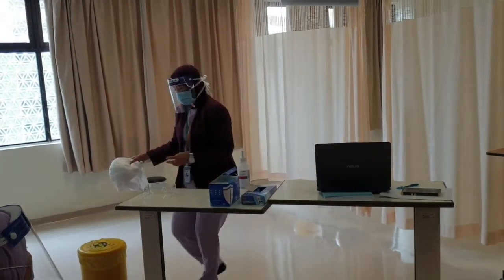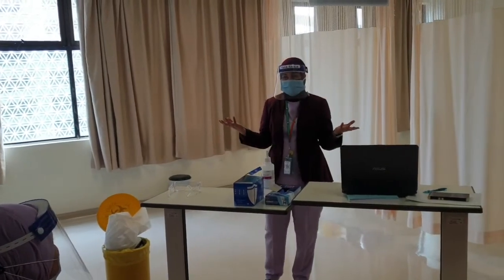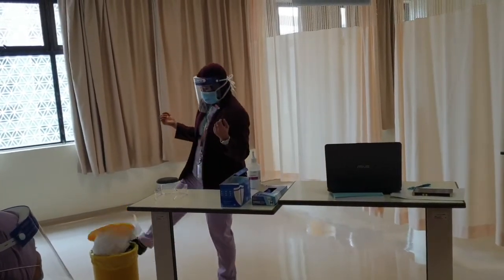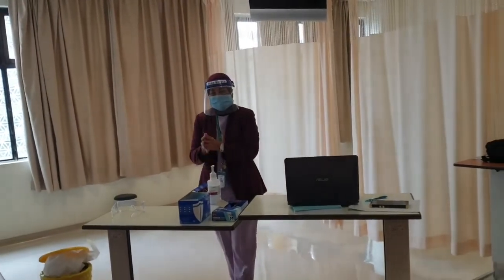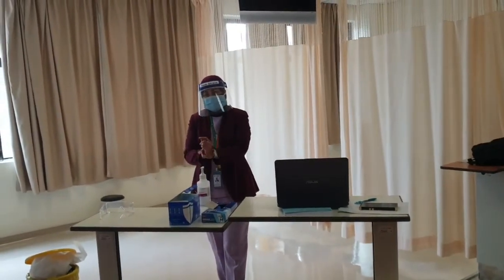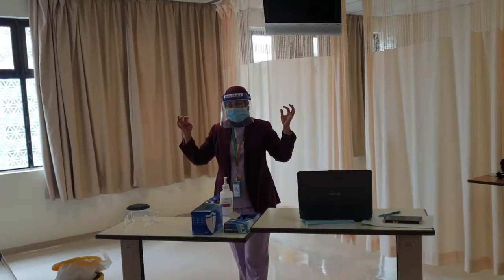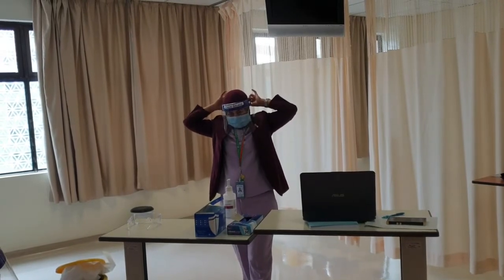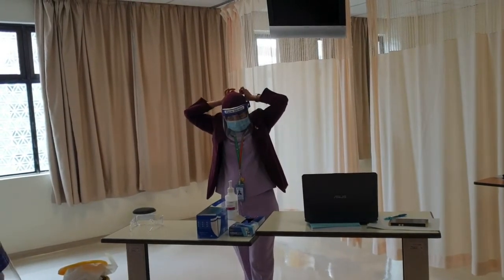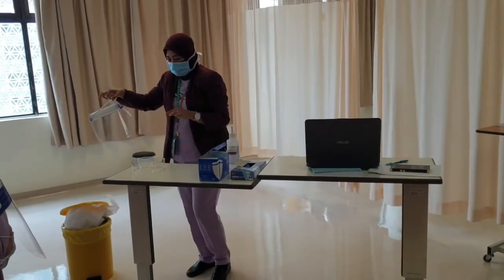And the gloves also the same. Then after this, remove the face shield from the back, then throw it.